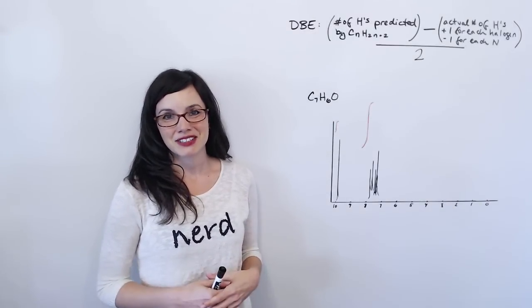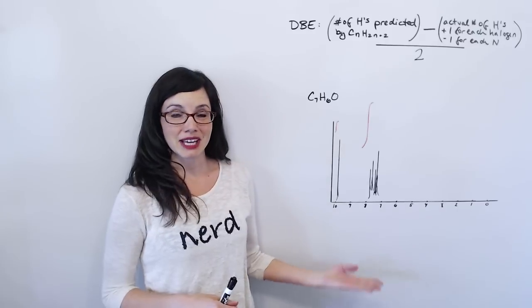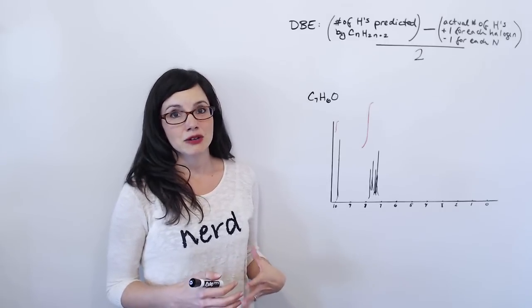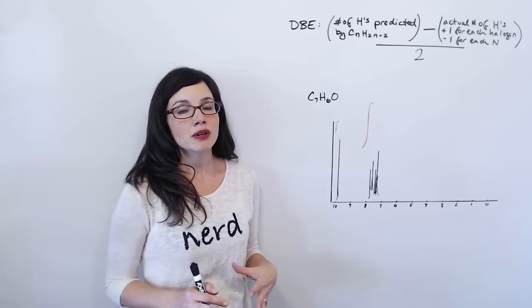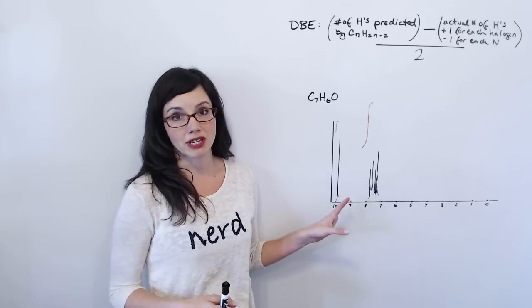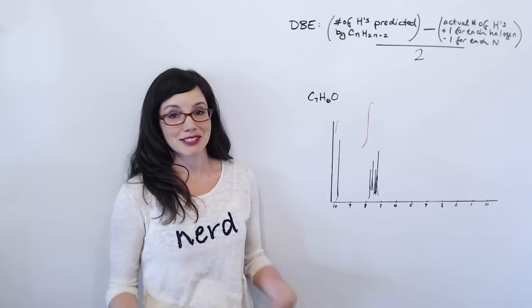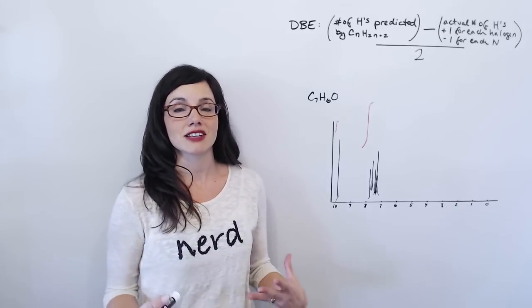In my NMR series, I'm going to teach you the skills that you need to take a molecular formula and an NMR spectrum and turn it into an accurate structural formula. Now, there are a lot of videos online that teach you the NMR theory that you need to know, but my focus here is really going to be on the skills and the process of interpreting the NMR spectrum. So my hope, though, is that by watching me do these processes over and over, you're going to pick up a lot of the skills and a lot of the theory that you need.